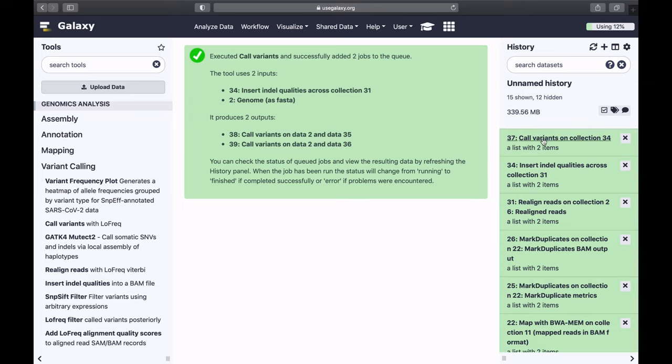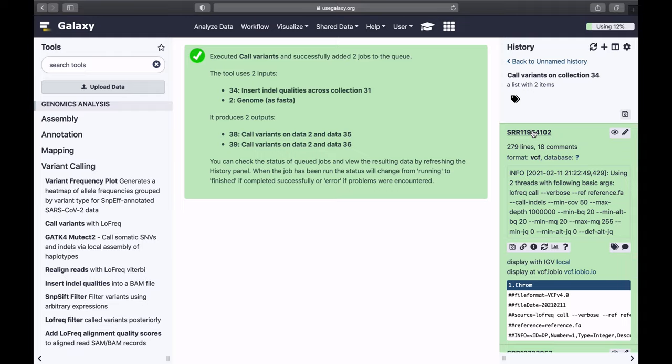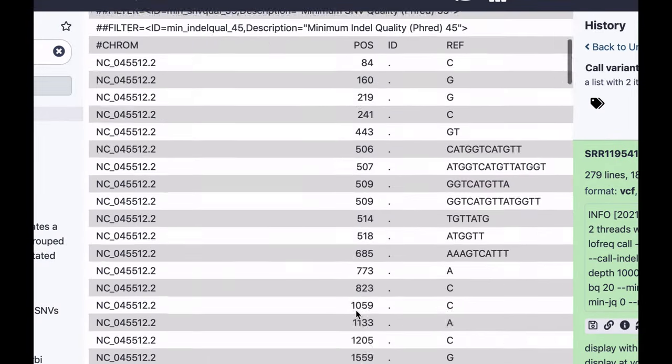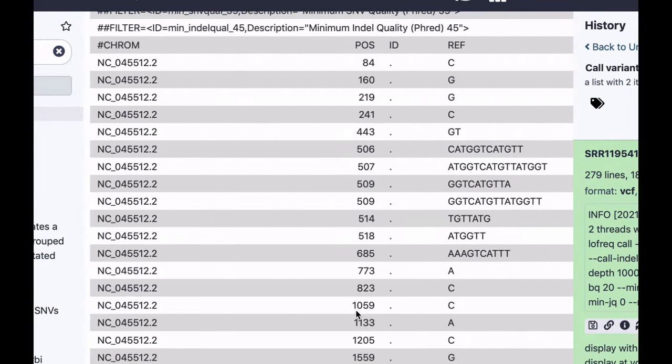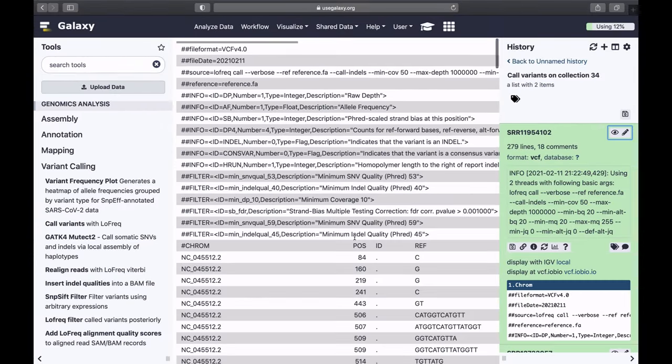So variants are called. You can see that we now have two data sets in VCF format. VCF format looks like this. Now we need to annotate them, meaning which variants are in coding regions, which are not, and so on.